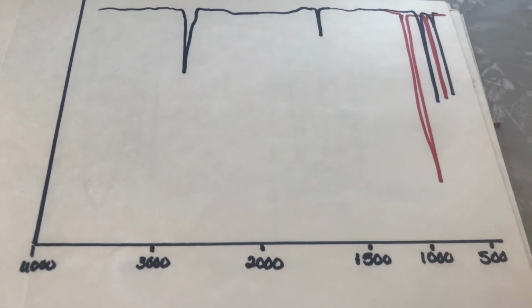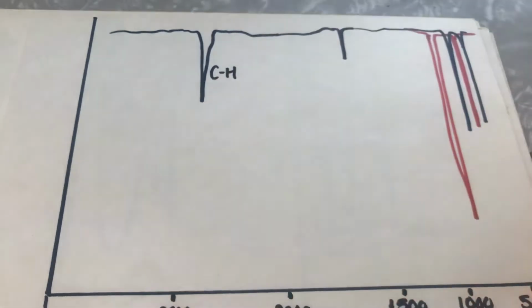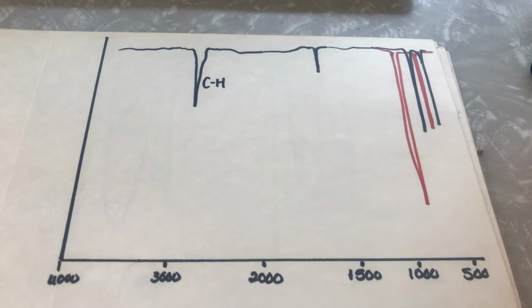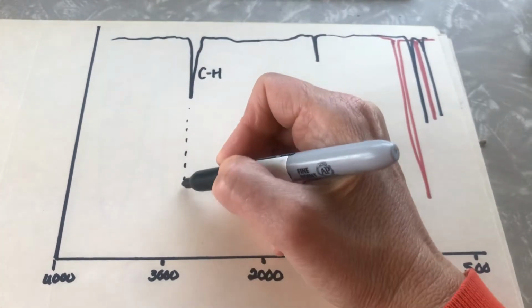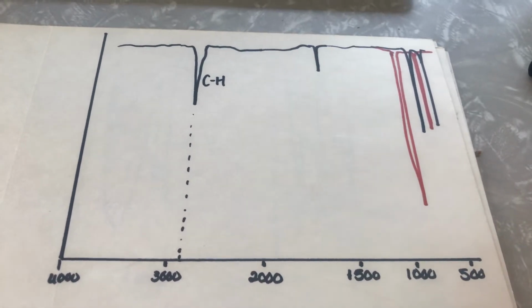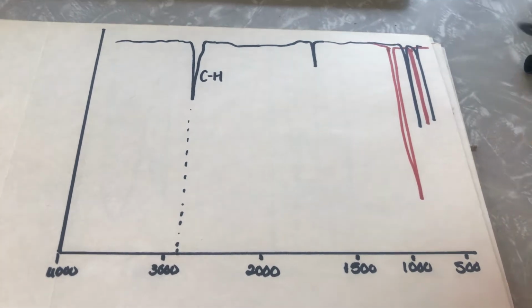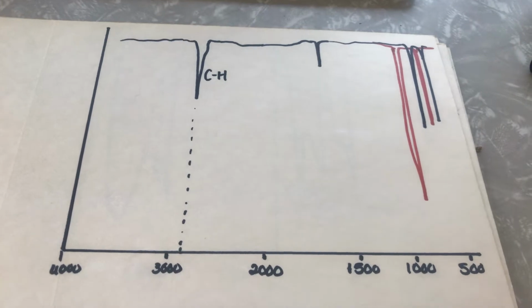Just one other thing about spectra is that they're not perfect. We give you as good a spectra as we can find, but in the real world these peak sizes really do vary. Where they're found varies slightly, but is pretty consistent. It's not exact, but it's around the same place every time. But the appearance of the peaks can sometimes be quite different.